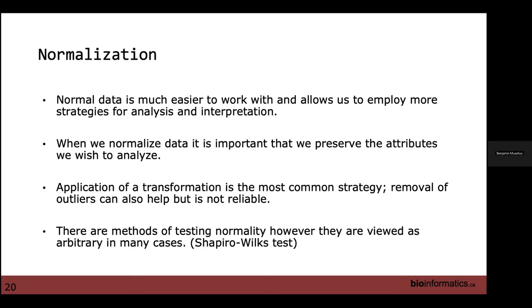I would say the easiest way to think of them is kind of two distinct phases. You set your parameters, you execute your MaxQuant or DIA-NN level analysis, and then what you take from there is what you perform your statistics on. If you were doing something like Florence was talking about, comparing different methods of analysis in DIA-NN or MaxQuant, where the point of your experiment was to quantify the difference caused by the parameter changes, then that would all become one big group. But for the purposes of, say, ticking match between runs or not ticking match between runs, you do those analyses and then treat them as completely different data sets. Does that make sense? Okay, cool.